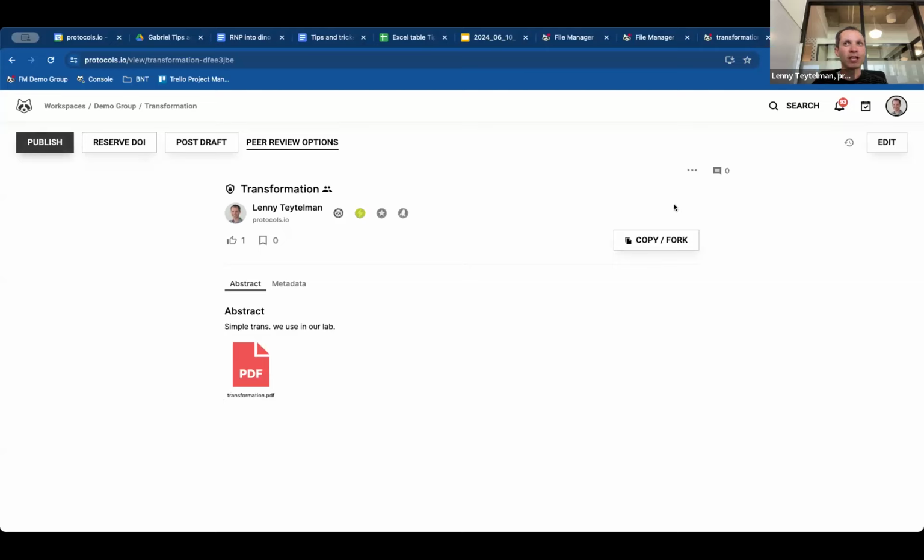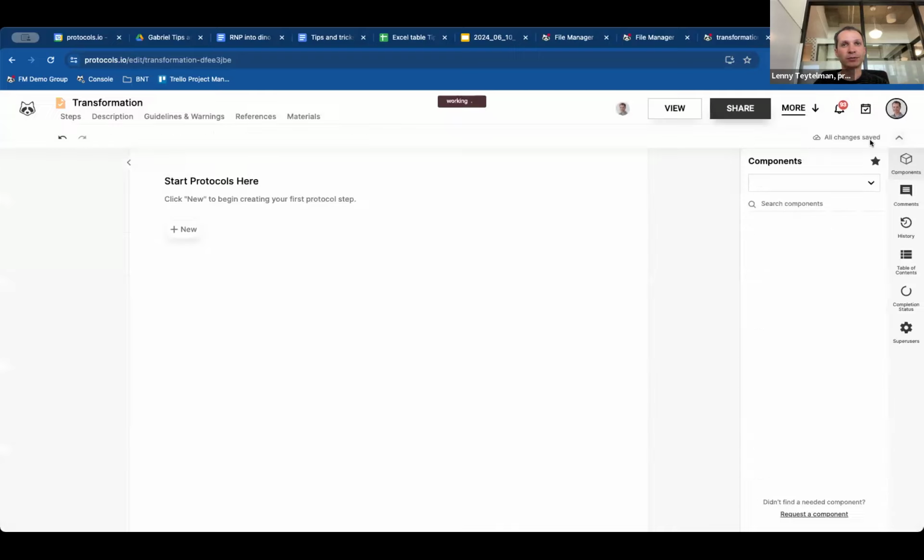And if and when time allows, just as a reminder, because we have versioning on Protocols.io, you can always come back, create a new version of the protocol, and take advantage, even after you've published it, of all of our functionality, some of which I'll be showing in a second, and go into the editor and add the step-by-step information. But if you have existing protocols, you have options for really quickly getting things in. The next thing is we'll go into the editor on our test protocol.